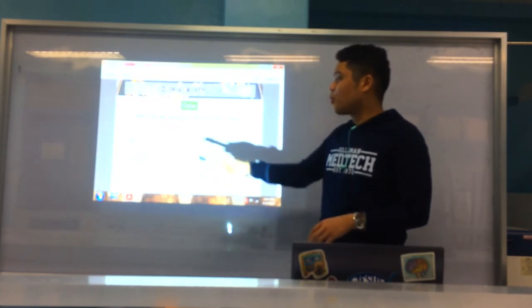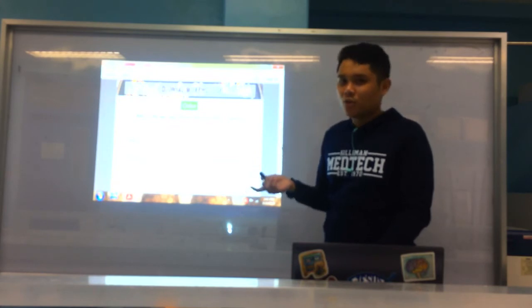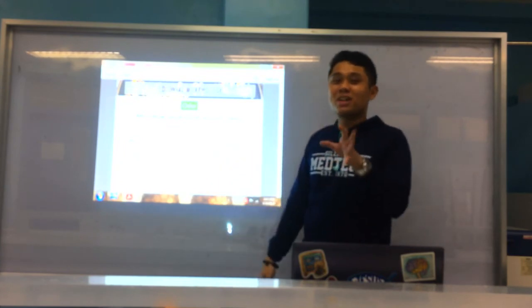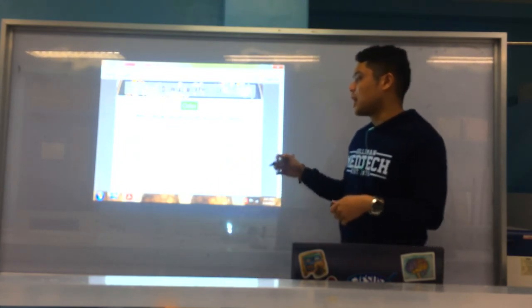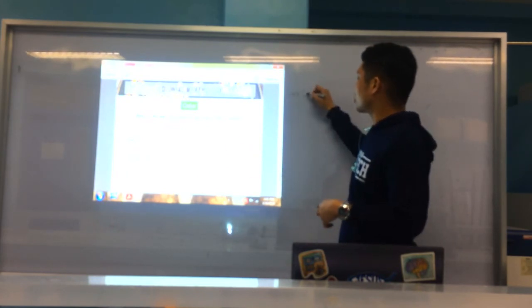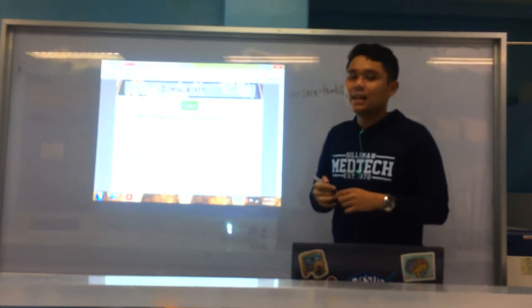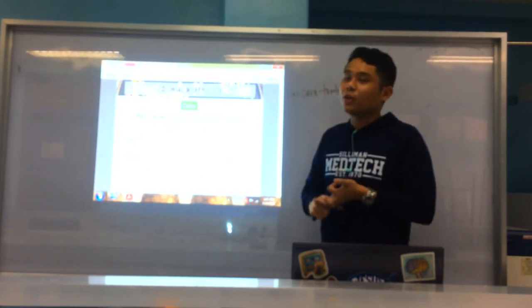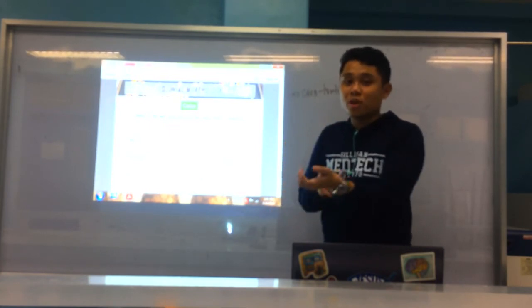For example, Staphylococcus aureus smells like an old sock. I don't know the smell of an old sock and I don't want to know, but yes, the odor is described as old sock. Next, Pseudomonas. Pseudomonas aeruginosa has a fruity or grape-like odor. It is also described as corn tortilla-like odor. If you smell fruity, grape, or corn tortilla, it could be Pseudomonas aeruginosa.